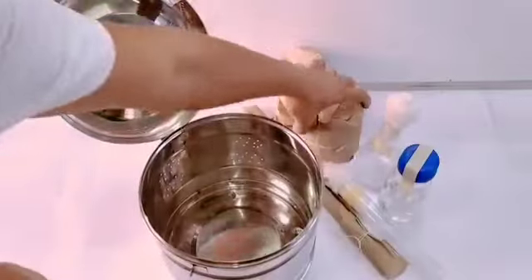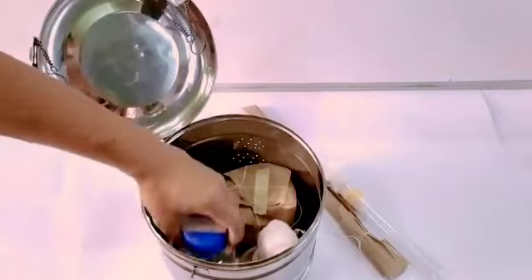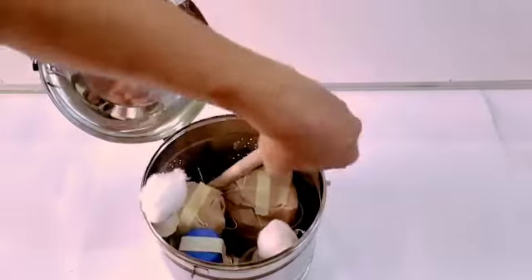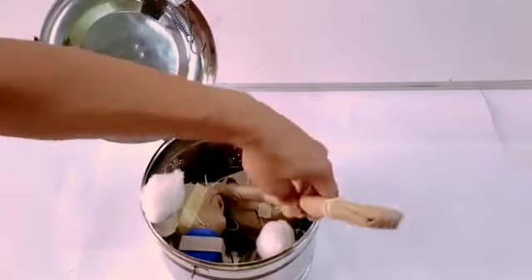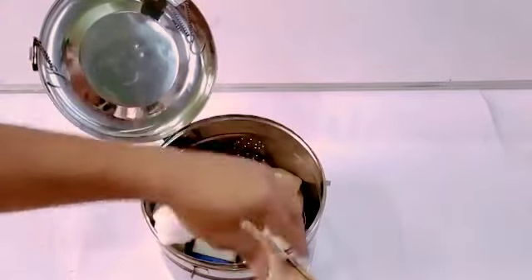Once the items have been processed for autoclaving, we place the items one by one into the sterilization bin or tray such that they fit snugly in the tray but without cramping, because we want the steam to effectively penetrate every nook and corner of the items to be sterilized.